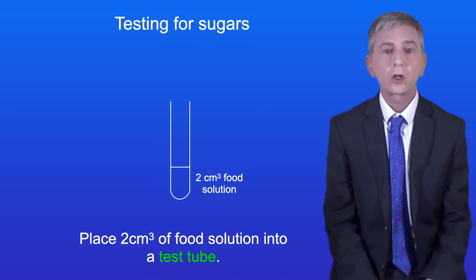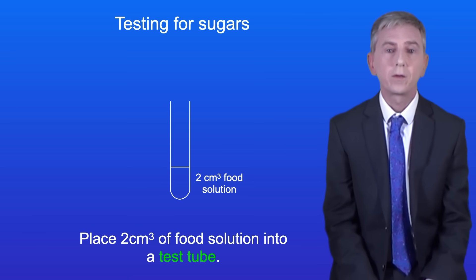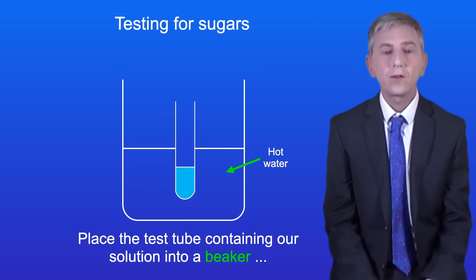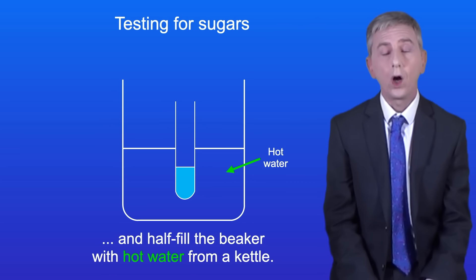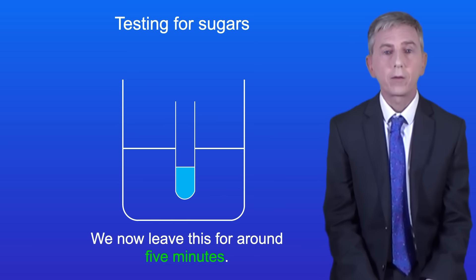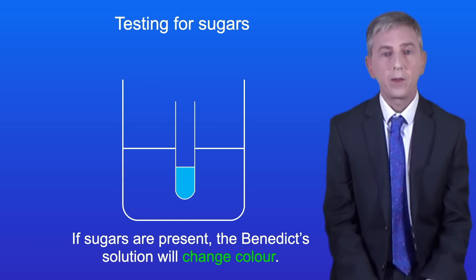Testing for sugar such as glucose is a bit more tricky. Again, we start with 2cm³ of our food solution. We then add 10 drops of Benedict solution, which is a blue colour. We place the test tube into a beaker and half fill the beaker with hot water from a kettle. We leave this for around 5 minutes. If sugars are present, then the Benedict solution will change colour.